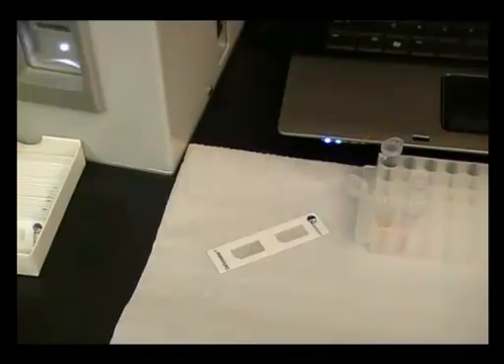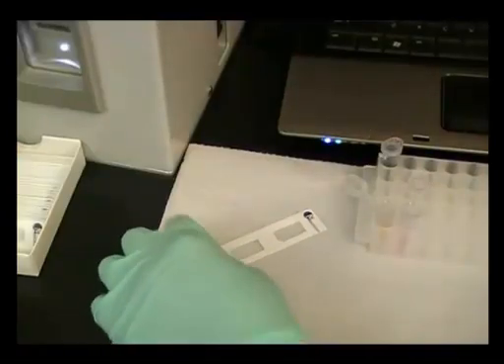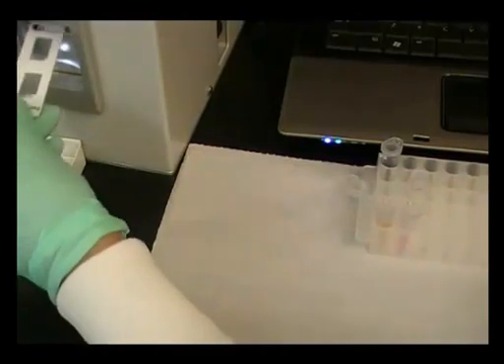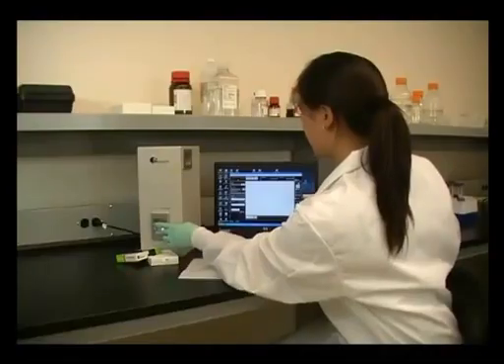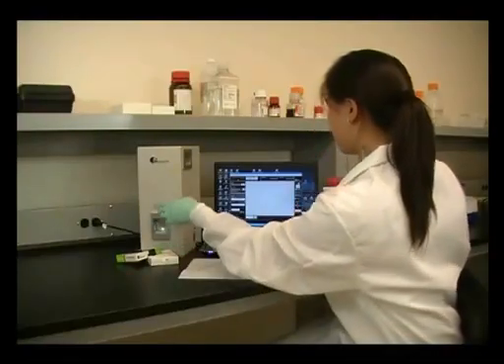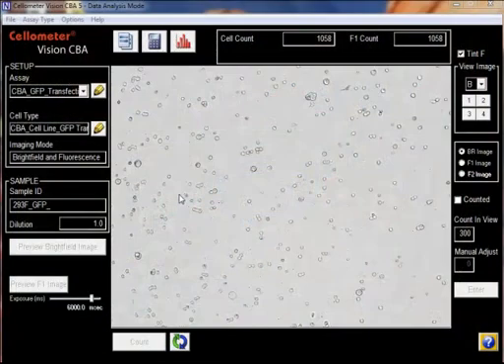20 microliters of sample is loaded into a cellometer counting chamber and inserted into the Cellometer Vision CBA image cytometry system. A bright field image is viewed to optimize focus and check cell morphology.